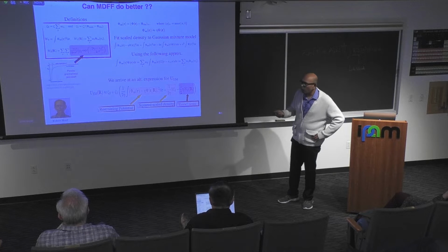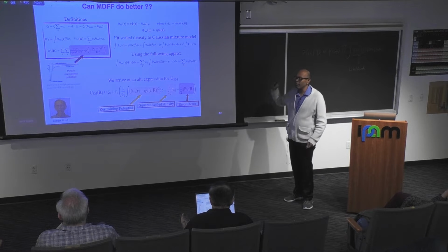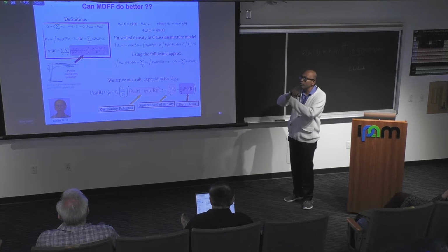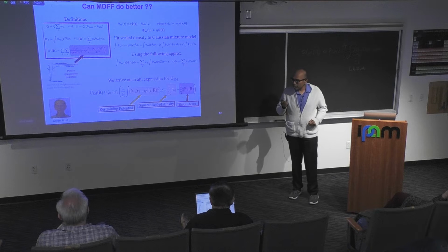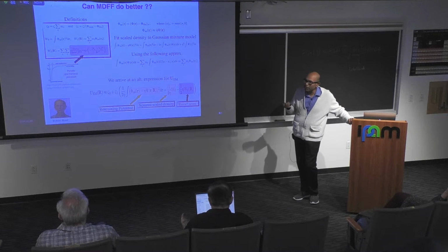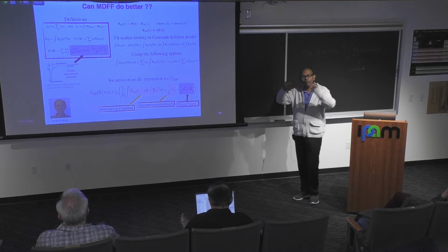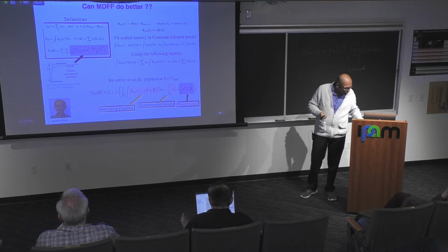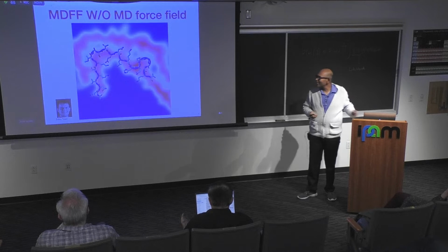there is, what were we doing? We were taking a density and we were putting atoms inside the density. We never said two atoms should or should not be on top of each other. Of course, we are doing it with molecular dynamics force fields. The force field tells us that the atoms should be far away from each other. So that's the only reason it was safe. Now we do an MDFF without the force fields. This is what happens.